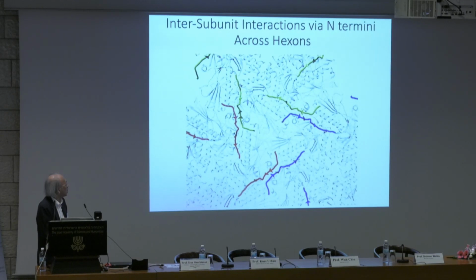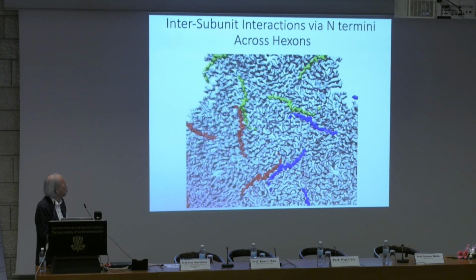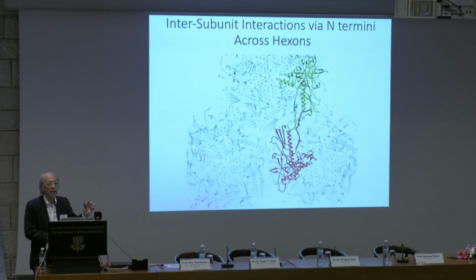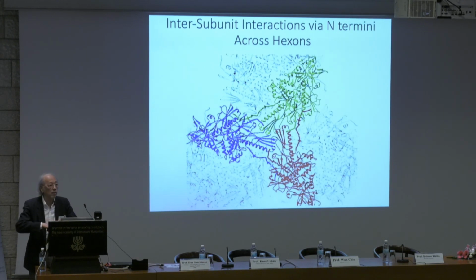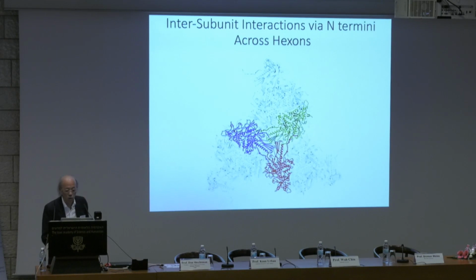So what we discover in our structure is that these N-termini are actually forming a beta strand. The distance between this N-terminus and the other termini is actually at the distance of hydrogen bonding. That means they carry 2 beta strands across from 2 different proteins. So I think that answers the first question, that the asymmetric units are held together through this hydrogen bond in the N-termini of the subunits, forming around these 3-fold locations.